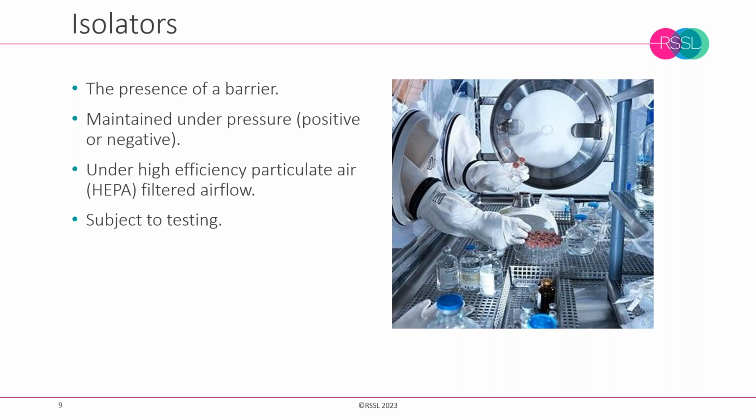And unidirectional airflow has an added advantage if the isolator has glove ports, for when an operator puts their hand inside the glove, then if there is any integrity loss of the glove down to the level of a pinhole leak, then when that hand goes in, there can be almost like a jet stream effect where air can be pushed through, and with contamination.